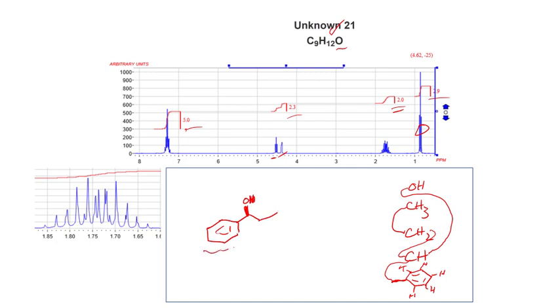We have our aromatic protons between about 7.2 and 7.4. We have hydrogen on the carbon with the OH around 4.5. We have an OH around delta 4.4. We have 2 hydrogens here in the CH2 as a very complex multiplet between about 1.6 and 1.9. And finally, we have our CH3 at its normal position of about 0.85. Okay, so everything checks, and we can be pretty confident that that's the correct structure.